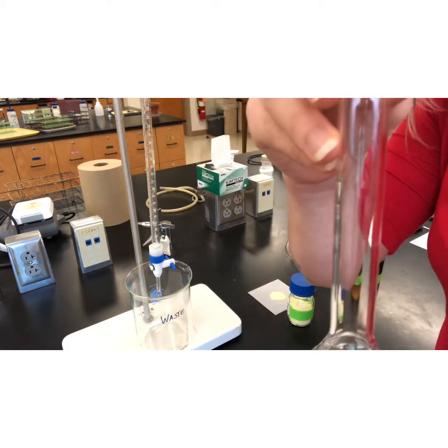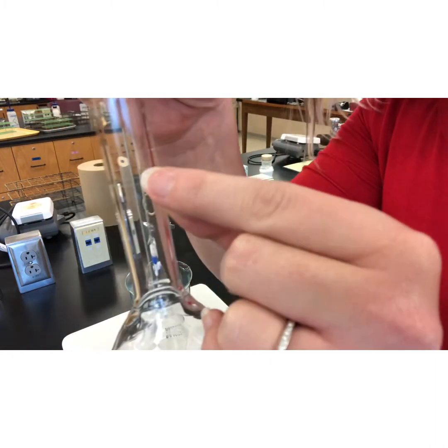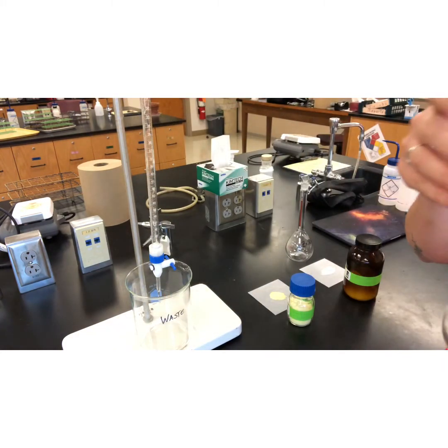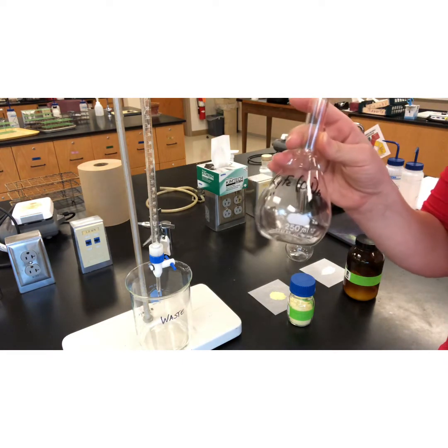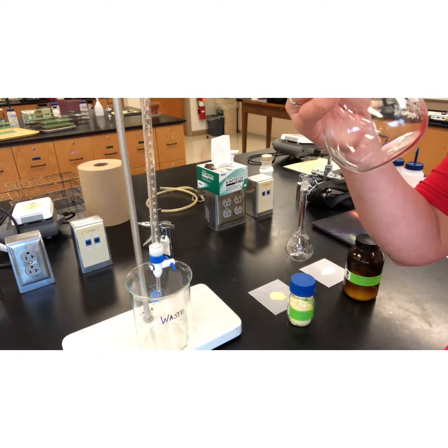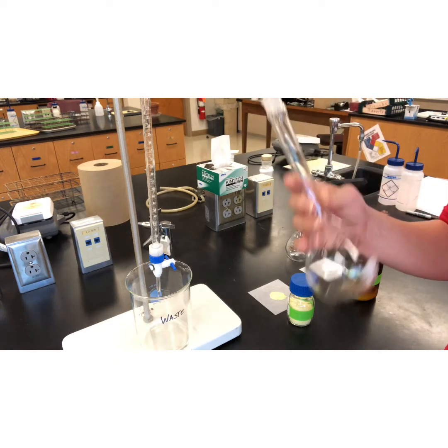There's a tiny, really faint line etched into the volumetric glassware. That tells you the line to which you should dilute your solution to have exactly 250.00 milliliters of this solution.